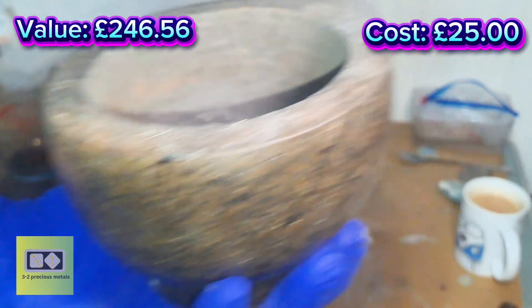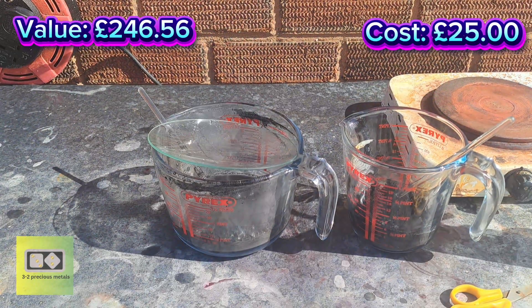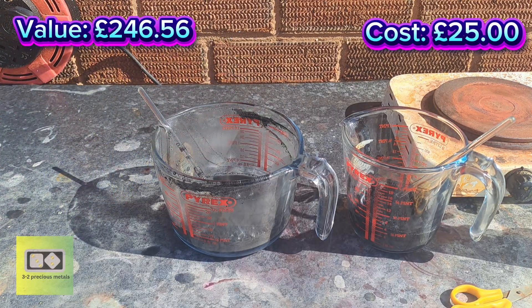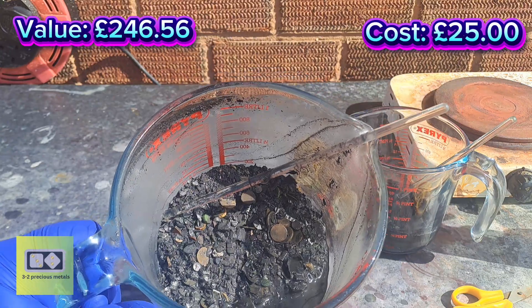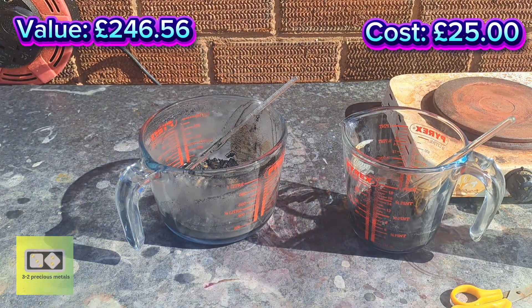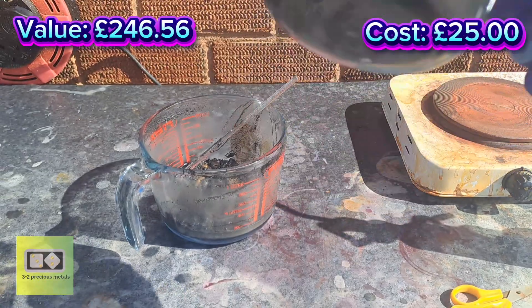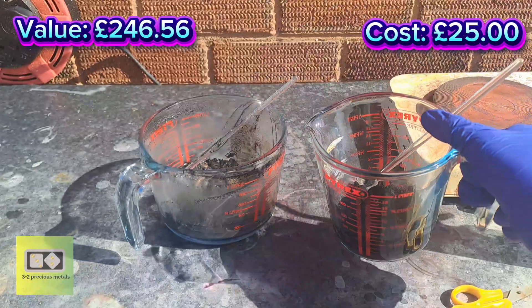The acid will work its way in and do its thing. In the beaker on the left we've got the capacitors and all that small stuff, and in the beaker on the right we've got the transistors and the small ICs that I'm hoping to get a little bit of gold out of. I can't see very much gold in the bottom if I'm honest — we'll see what happens.